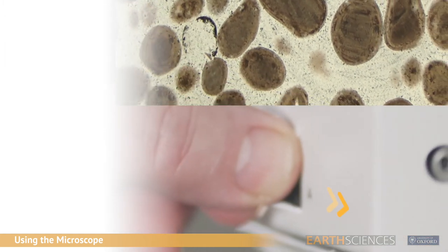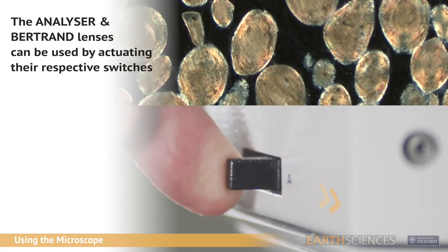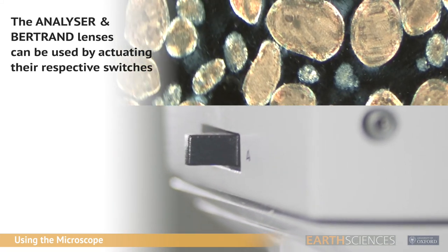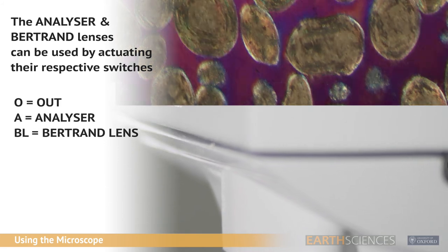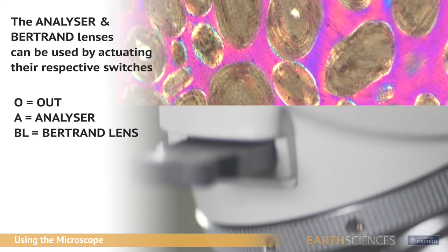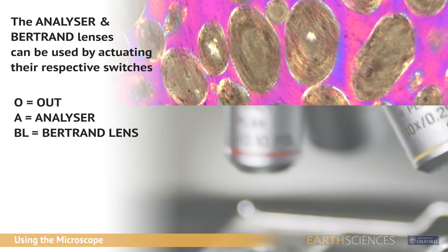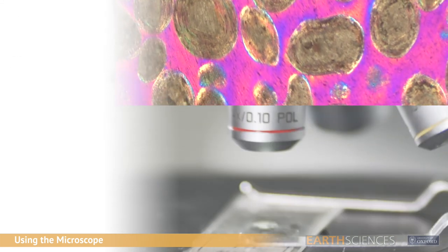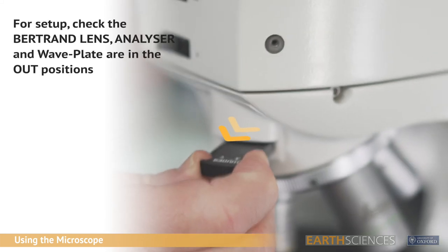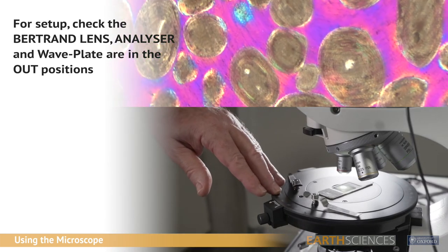Between the binocular viewing tube and objectives is the analyzer and Bertrand lens units. Both are operated by lateral switches. O indicates out and A or BL the in positions. For initial setting up, ensure that both are in the out position. Also check that the wave plate is in the out position.